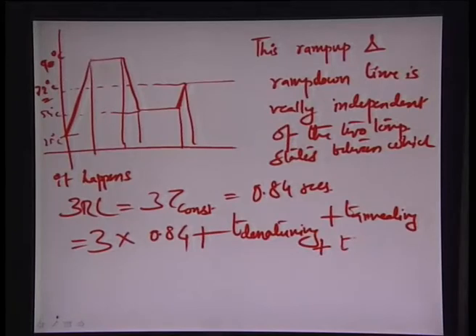Now if you are to assume that there is a surface where we can rapidly change the temperatures, without really having to wait for the temperature of the surface on which this reactor is placed to reach the particular temperature point. So in that case, the only time that is needed, assuming the temperature of 90 is just about met, or the temperature of 72 is just about met, is to heat up the bulk, which again is constant. It is not a function of the 2 temperature states, but just the volume to area ratio, which determines in fact the time constant in that particular case.